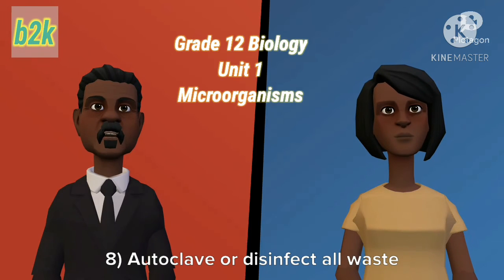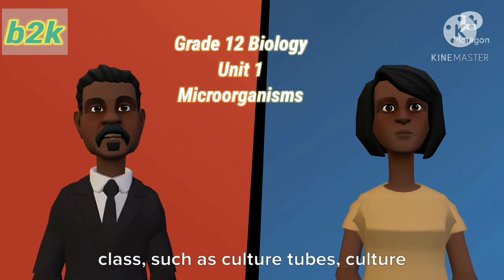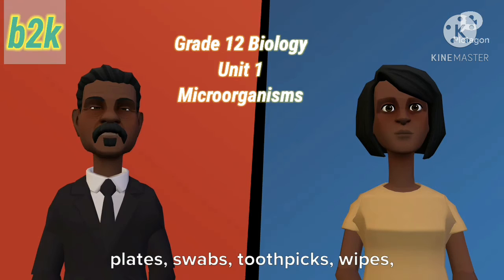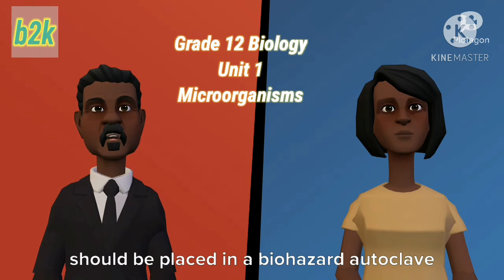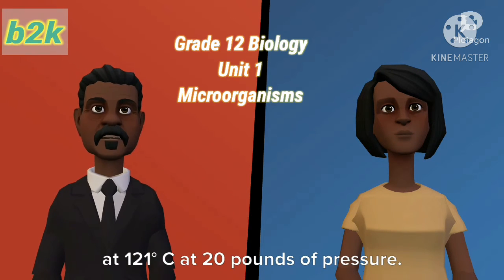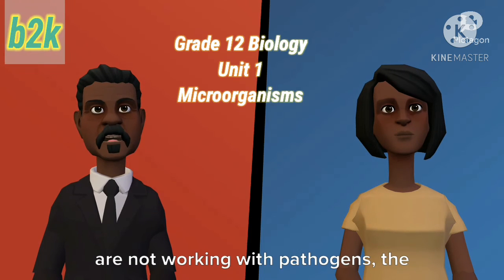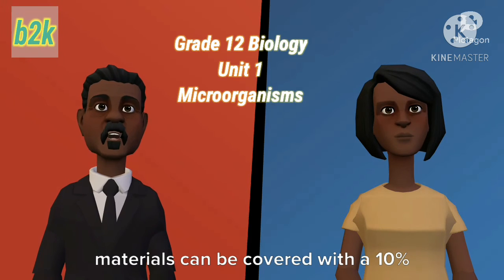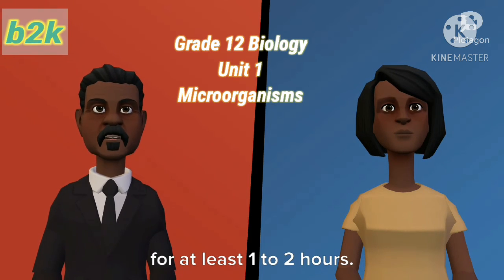8. Autoclave or disinfect all waste material. All items to be discarded after a class, such as culture tubes, culture plates, swabs, toothpicks, wipes, disposable transfer needles, and gloves, should be placed in a biohazard autoclave bag and autoclaved 30 to 40 minutes at 121 degrees Celsius at 20 pounds of pressure. If no autoclave is available and you are not working with pathogens, the materials can be covered with a 10% bleach solution and allowed to soak for at least 1 to 2 hours.